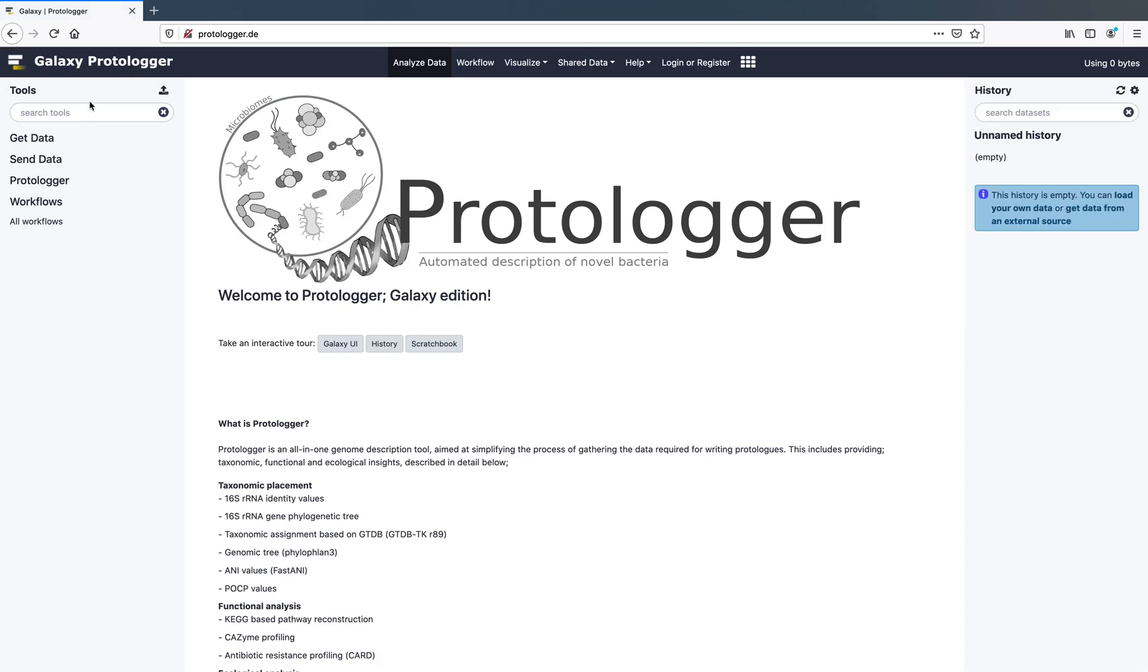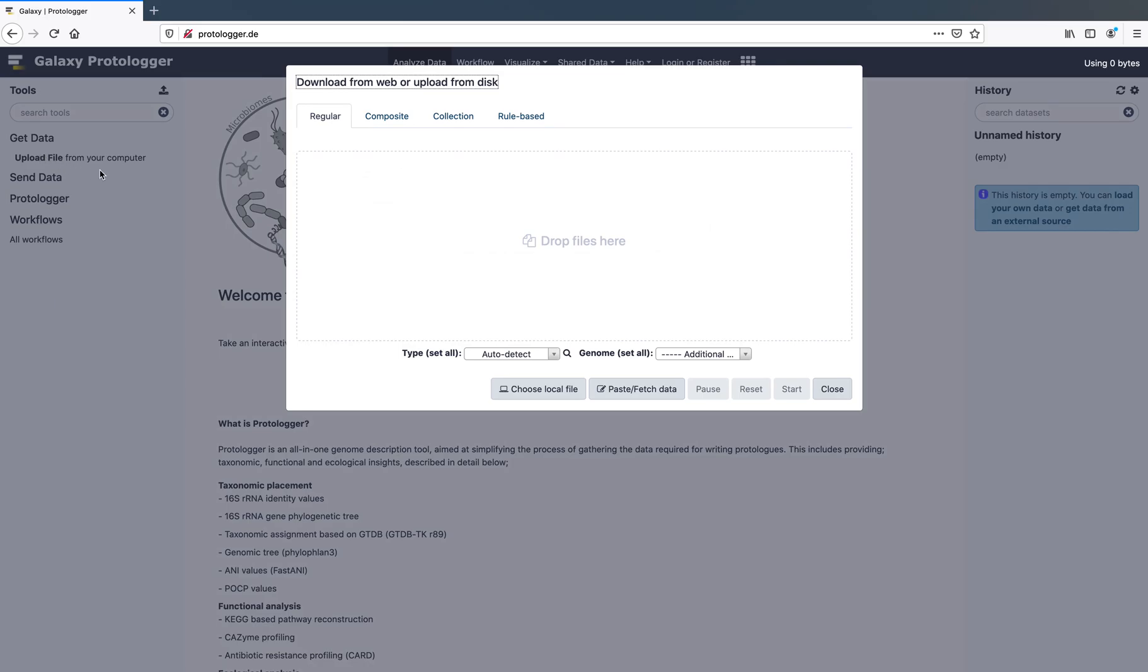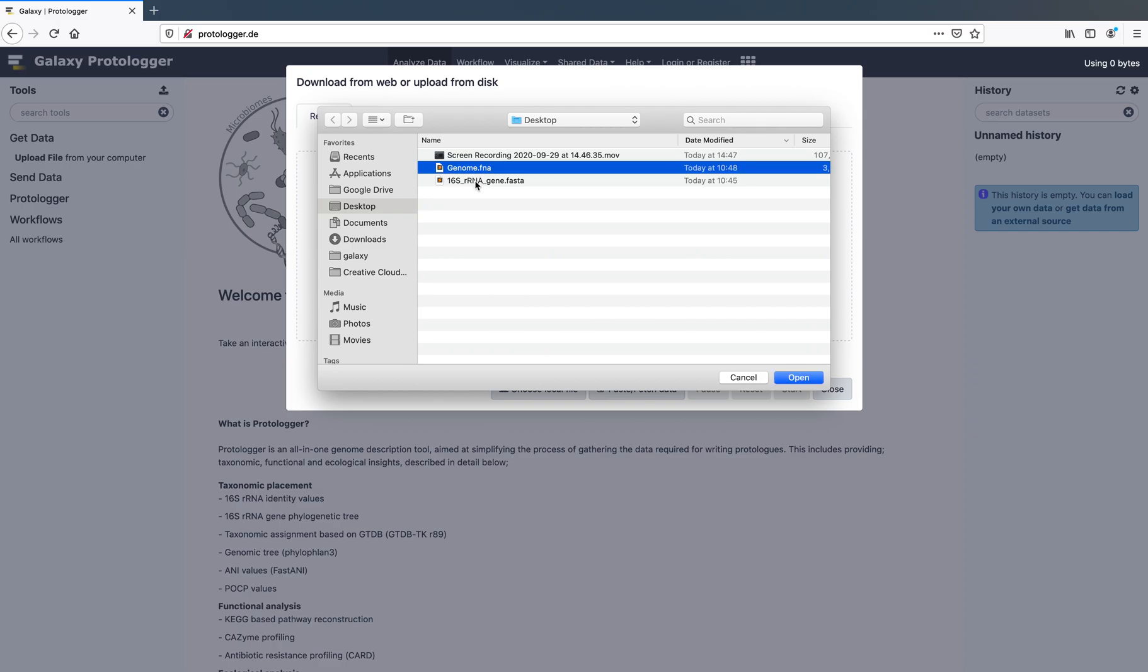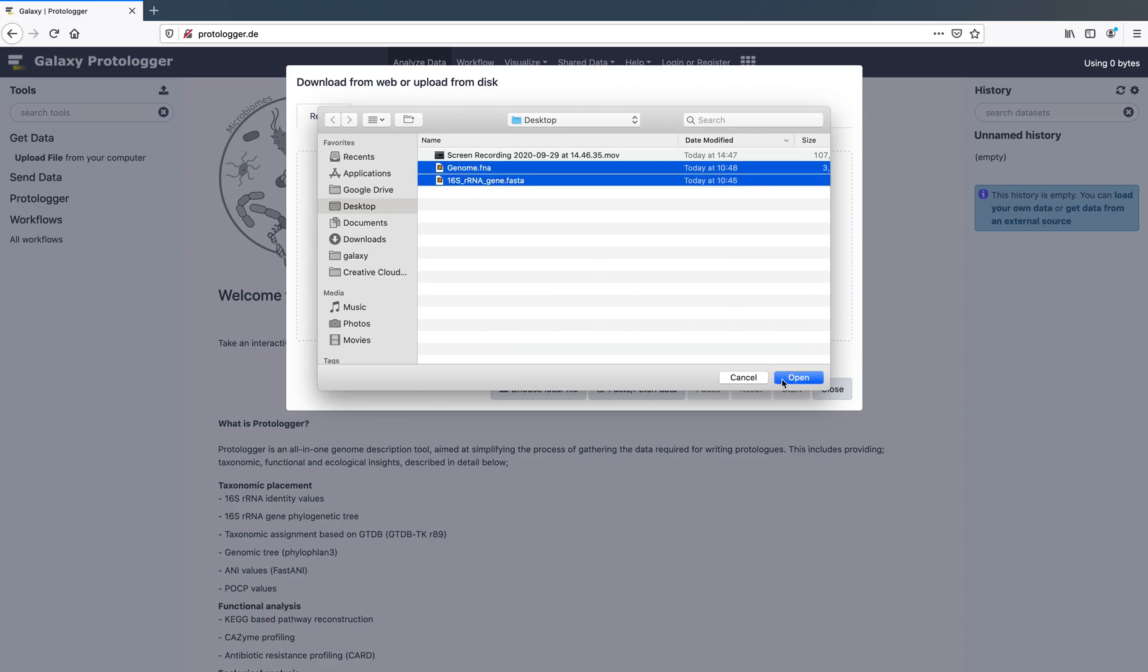First, you must upload your data. Click on the Get Data button on the left and then Upload File. Next, either drag your files here or choose Local File. Once selected, click Start and your files will begin to load onto our servers. This will be shown in your history on the right-hand side.